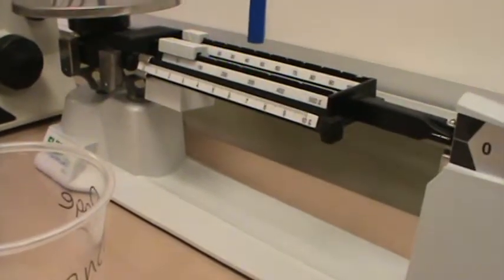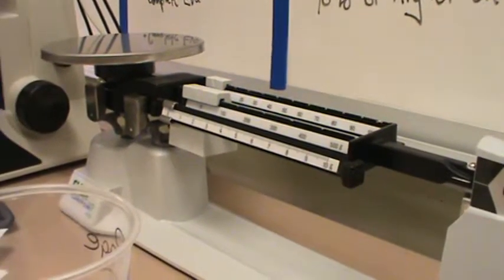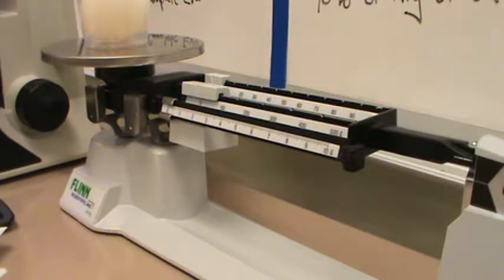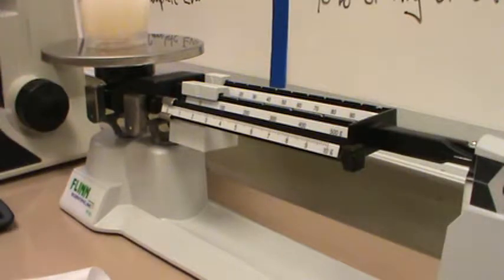Okay, so I've got the triple beam balance. You're familiar with our triple beam balance here. And we're going to set that on. And as you can see, definitely more mass. Let me go back to what I was explaining. So in the vinegar that we used, the vinegar was 95% water and 5% acid. The acid took care of the shell.